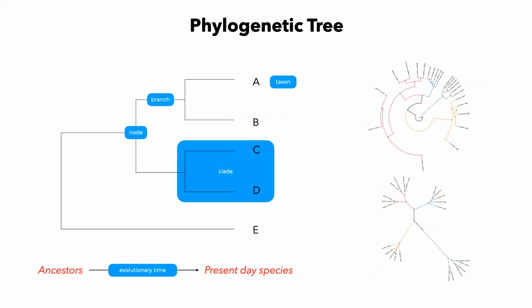This phylogenetic tree can help us map the differences between genomic sequences in such a way that we can associate it with a process of going from a single ancestor to then dividing up into branches, just like a family tree would, that we can study for variability and evolutionary distance between each one of our members in the data and the potential common ancestor that they might have. So what kind of information can such an analysis yield?